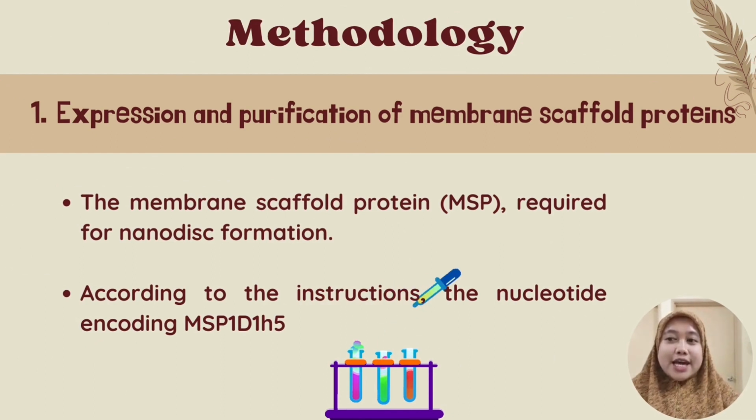Okay, for methodology, expression and purification of membrane scaffold protein.